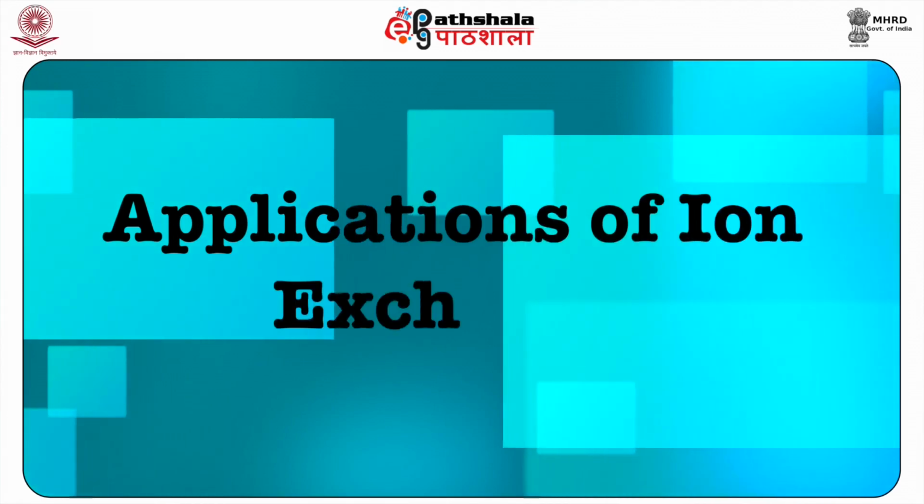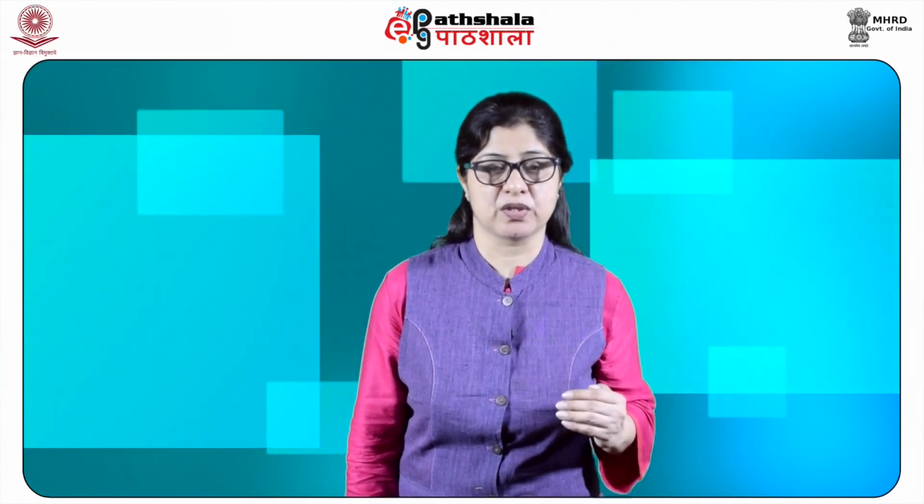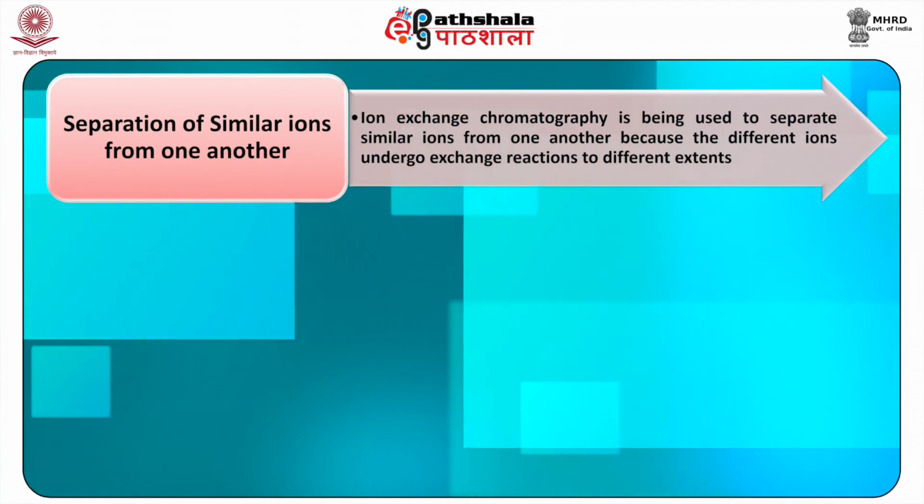Applications of ion exchange. Because of the particular selectivity forces of the material, separation with ion exchange is used. Organic ions which form salts with oppositely charged ions in another phase can be separated too. Almost all ion exchange reactions require aqueous solvents. Some applications of the ion exchangers are as follows. Firstly, separation of similar ions from one another.